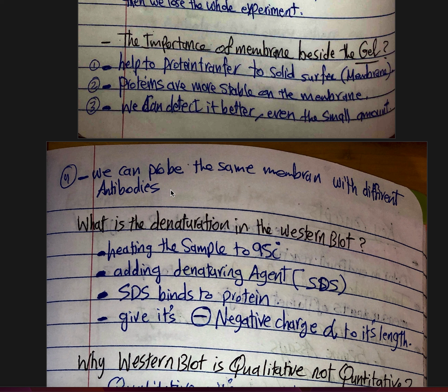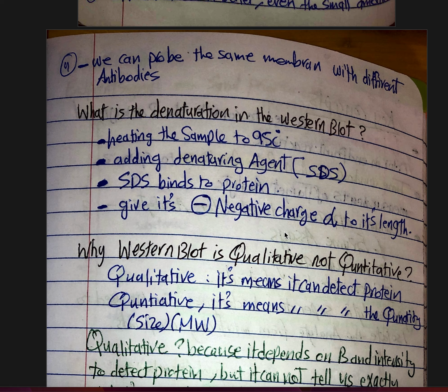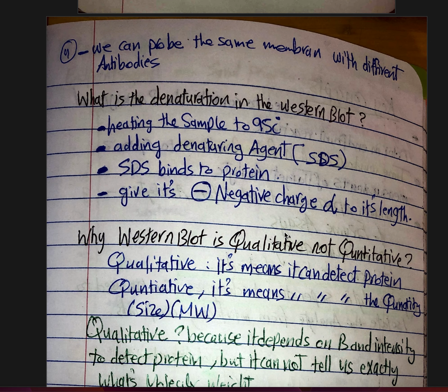And so we can probe the same membrane with different antibodies. Yeah, we can use the same membrane with different antibodies. What is the denaturation in the Western blot? This is another question. How can we do the denaturation?